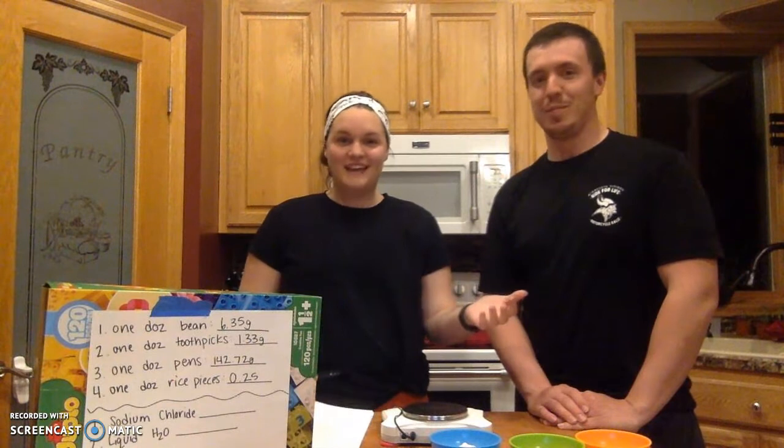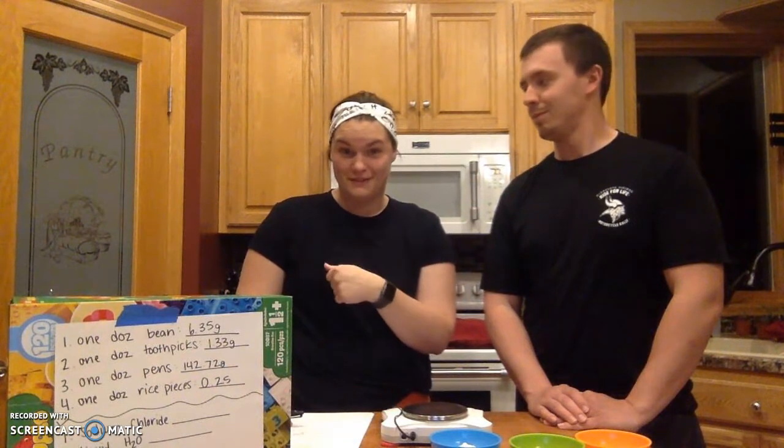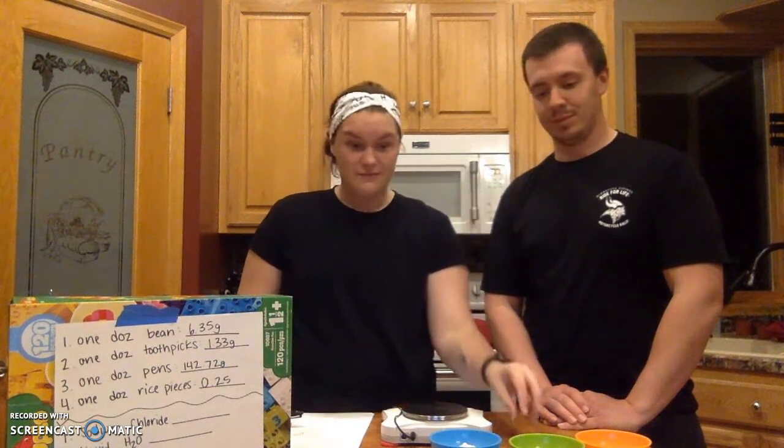Okay, we're back. Hopefully you got those 6 questions answered. Basically what I wanted you to get at was that we measured the same count of all of these things, but they're all different masses. Okay, so now we're going to look at 3 different substances. Now I usually use different substances, but being that we are at home, I had to use chemicals that are readily available. So we have salt.